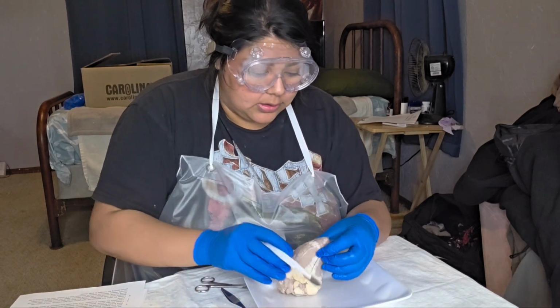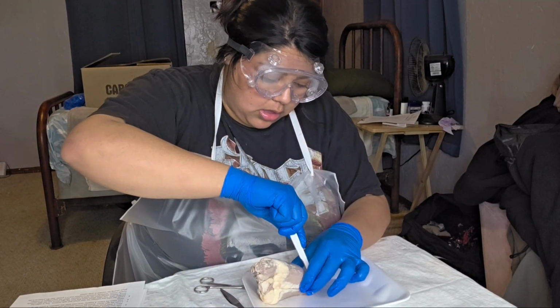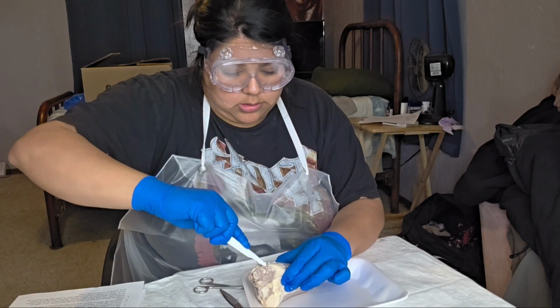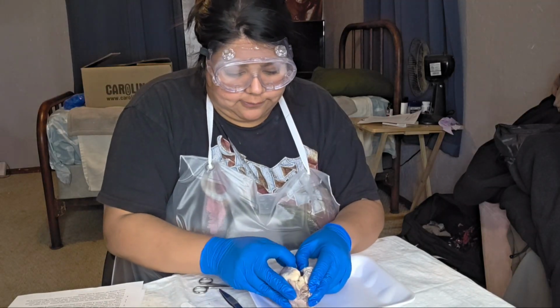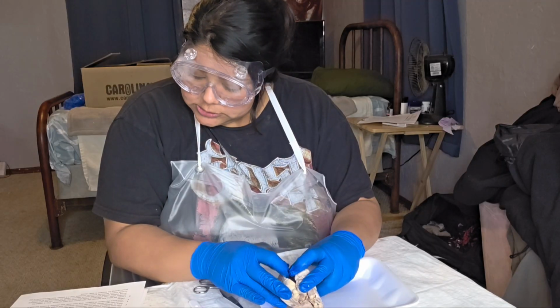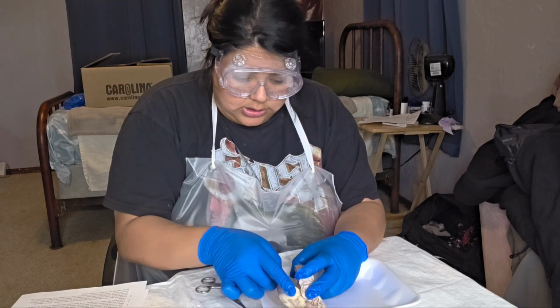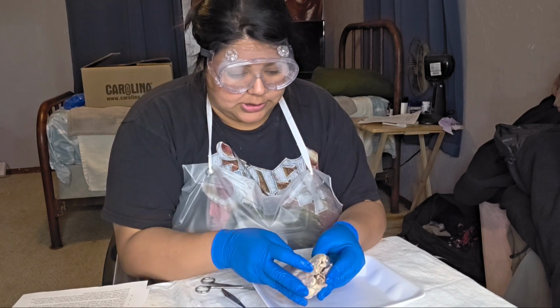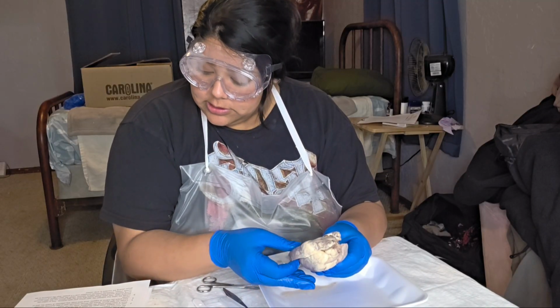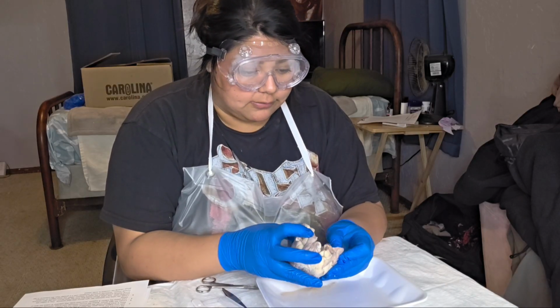We made our cut through here. Push your fingers through, push open the heart and look at the internal structure. Locate the right atrium, which is down here, our right atrium. We notice the thinner muscular wall of the receiving chamber. Find the inferior and superior vena cava.